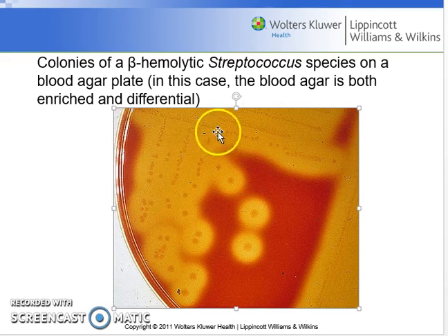If a patient were infected with this bacteria, and it got into the patient's cardiovascular system, that can be a very big problem, because look at the effect this bacteria is having on all the red blood cells in this plate. Loss of red blood cells leads to loss of oxygen, which can lead to death. So it's really important for us to grow microorganisms on blood agar, so we have a better understanding of how they will grow when they're inside of the body.